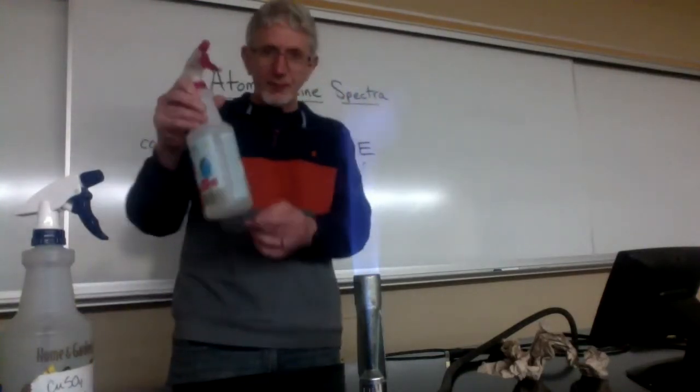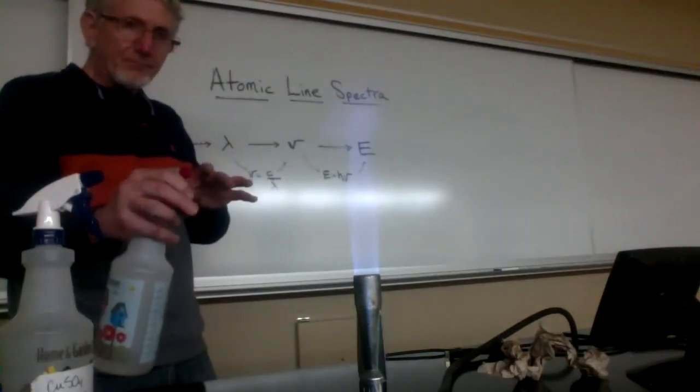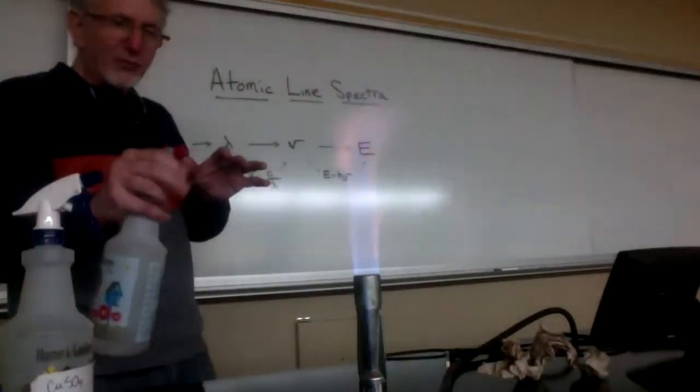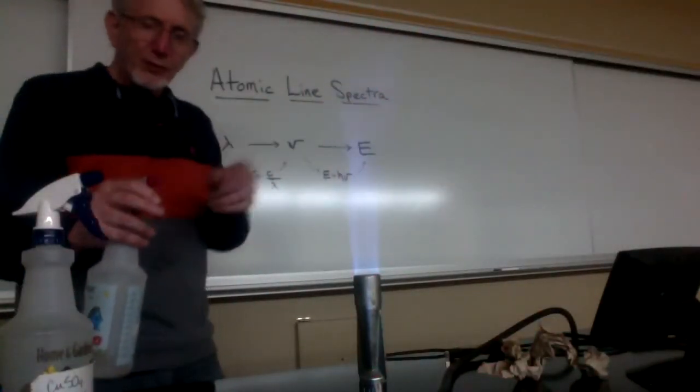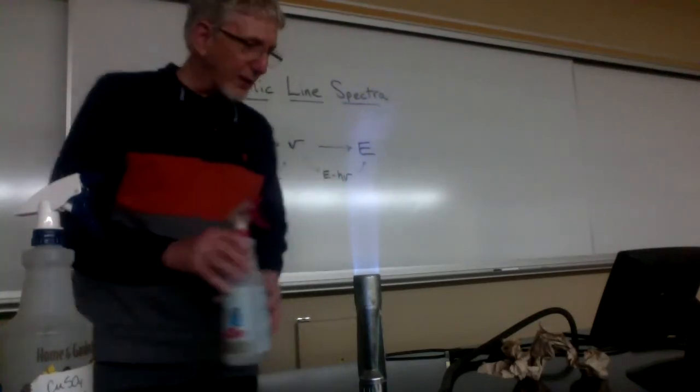Let's start with strontium here. So we have strontium atoms that we're going to excite in this flame. And you can see the, hopefully, you can see a bright red flame there as those atoms emit not just any wavelength of light, but a wavelength of light that produces this distinct red color.